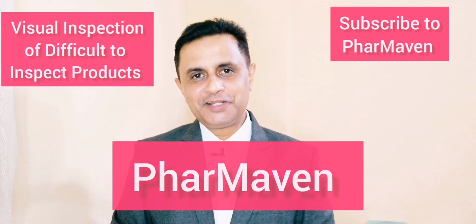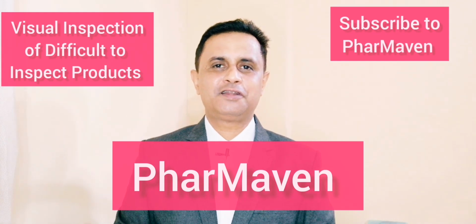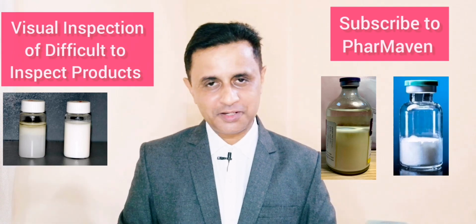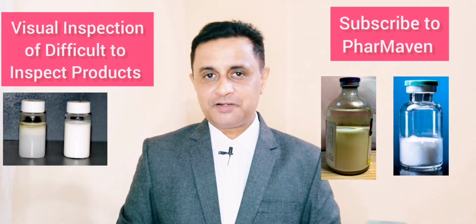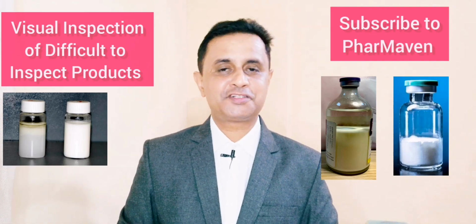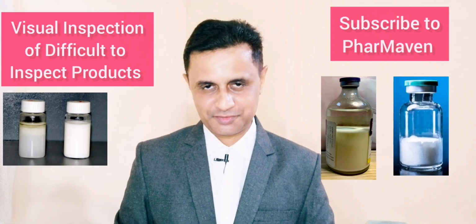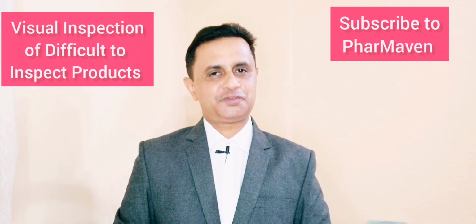In today's video, we will discuss visual inspection of lyophilized products, suspension products, emulsion products, and powders. These products are difficult to inspect. So we will understand how we can perform visual inspection of such products. Starting with the lyophilized product.